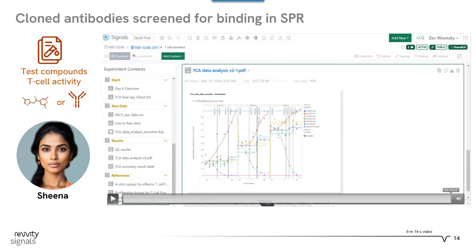That needs to be a report, right? We have various different cell populations we care about, and the various different images that we're looking at in this particular view. That can be programmatically pushed back into the notebook. Even though I wanted to show you that I'm pushing it in, you'll have to take my word for it, and we can share out a video later. That information can be pushed back into the notebook and can be downloaded or shared, shown in a PowerPoint presentation, et cetera, in various different forms.